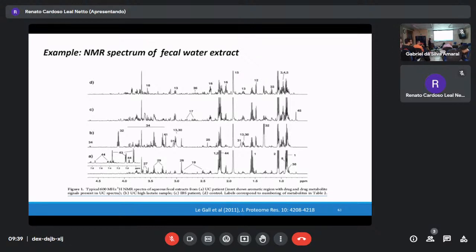When you separate the protein and you want to analyze the amino acids in the sample, is it a problem? No, because when you precipitate, of course some co-precipitation is possible, especially if you keep it a long time.